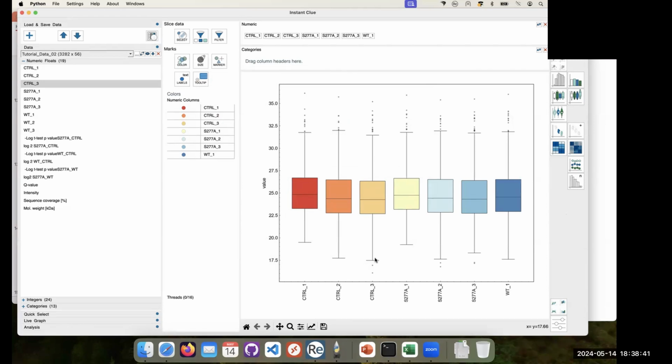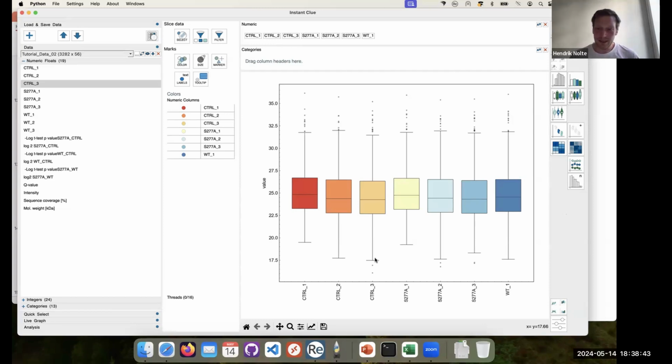At least in proteomics data, this would indicate that there is a significantly lower number of proteins identified, because the software will try to correct for this minimum number of proteins by shifting them up, since the algorithm always believes that most of the proteins will remain unchanged, and then usually it overestimates the intensities a bit, and therefore you see these outliers.